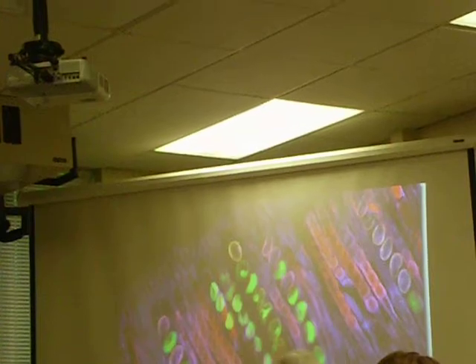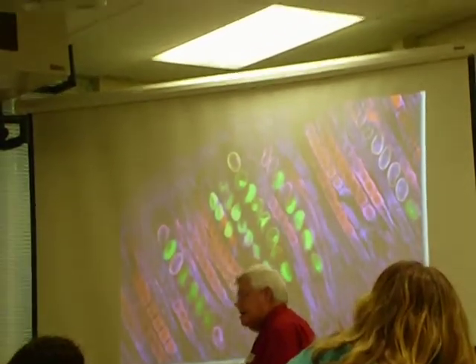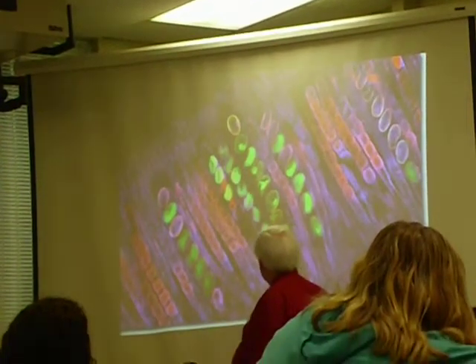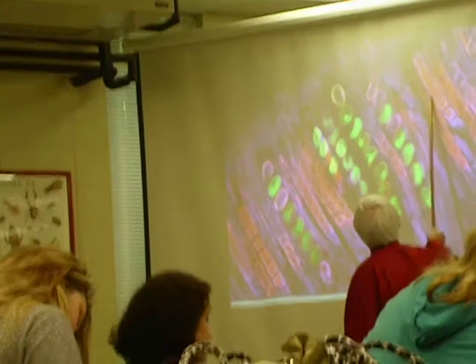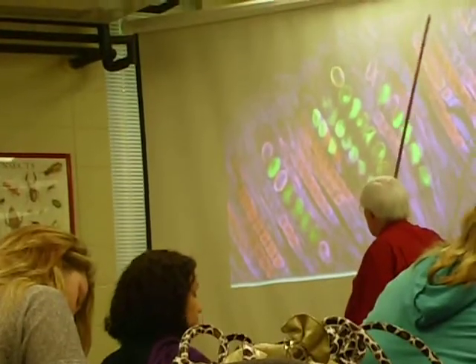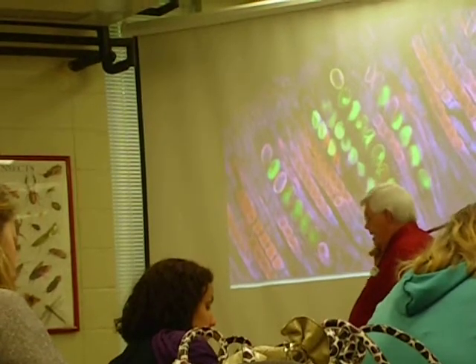What division is represented here? Ascomycota. What are the fluorescent colored structures? Ascospores. How many are always produced? 8. You knew that one.